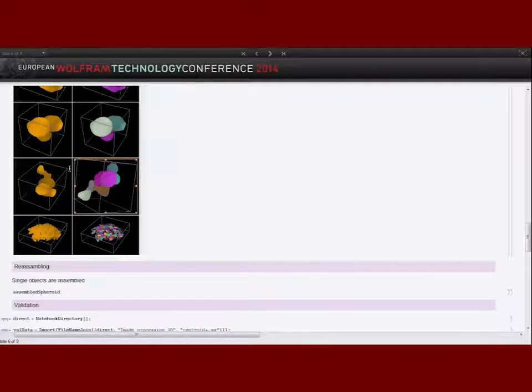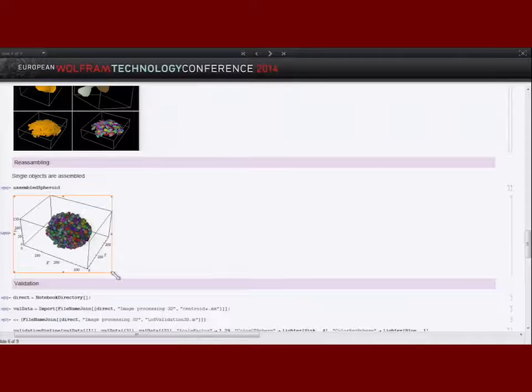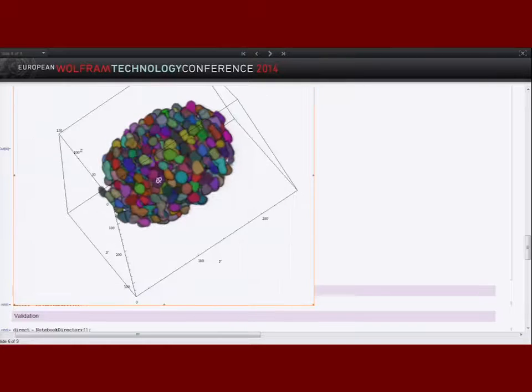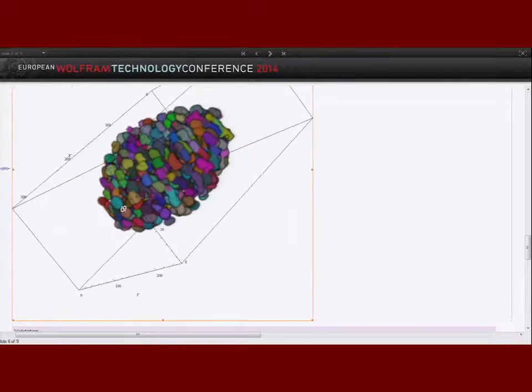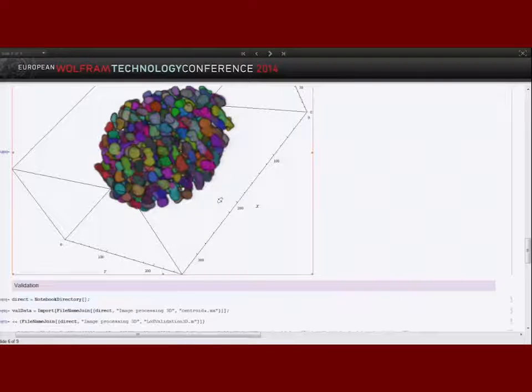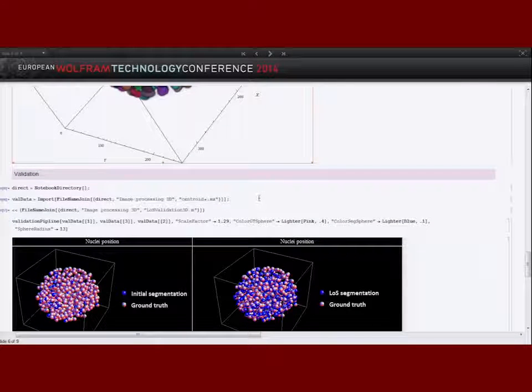The last step is to take all the single objects that were split and reassemble them into the final spheroid. Different colors mean different cell nuclei. When we look at the back of the spheroid, it's more reasonable than the intensity-based segmentation result.